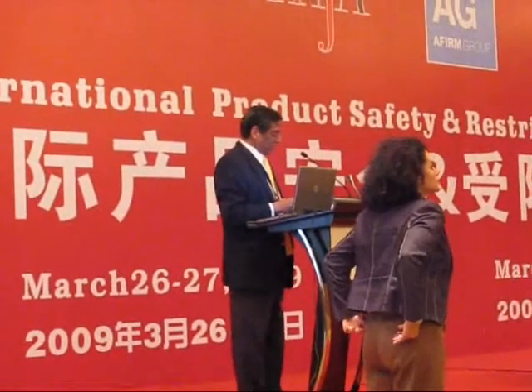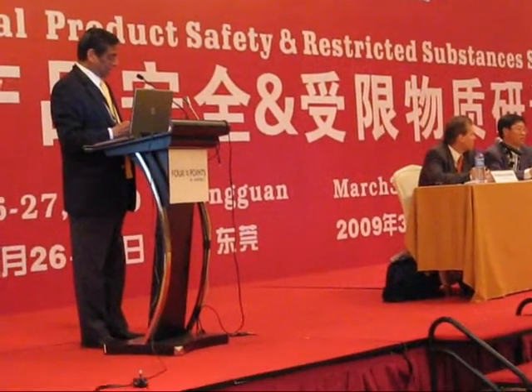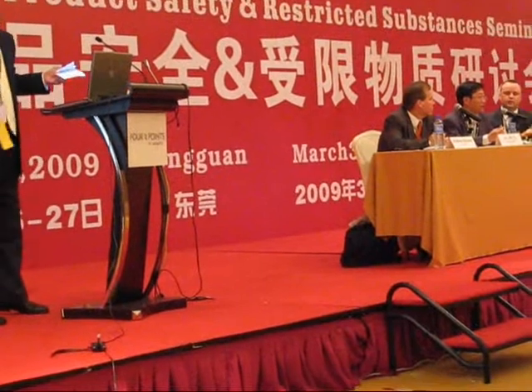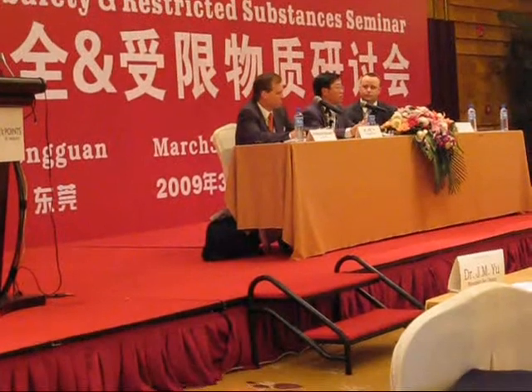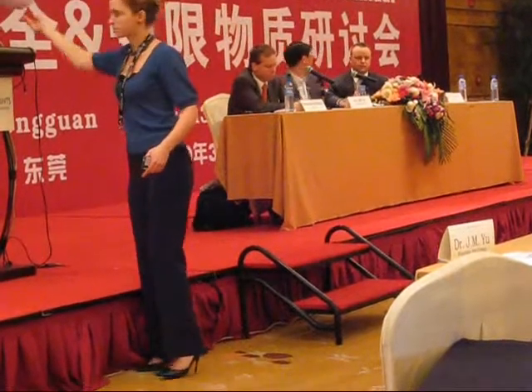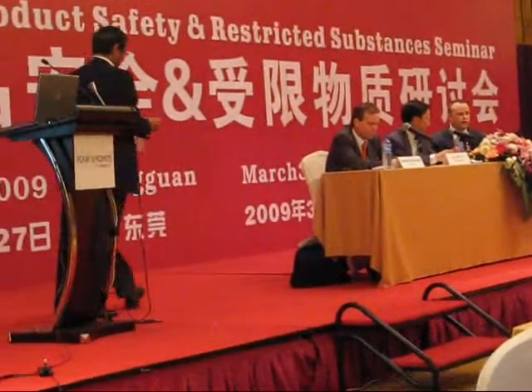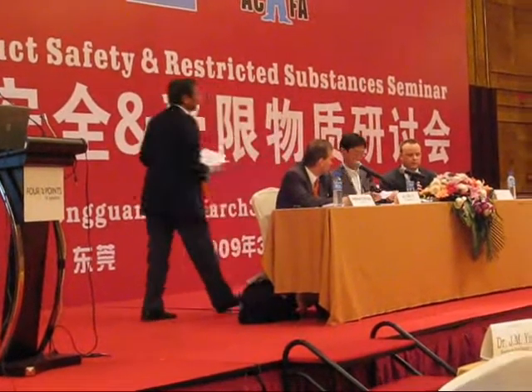Is the Innov-X XRF capable of testing the four heavy metals under the toxics in packaging legislation of numerous U.S. states? Can your XRF test for BFR chemicals? I would ask which specific chemicals that would be. That would be the heavy metals. The heavy metals we can analyze. These systems can come calibrated for a wide range of elements, and can be factory calibrated.